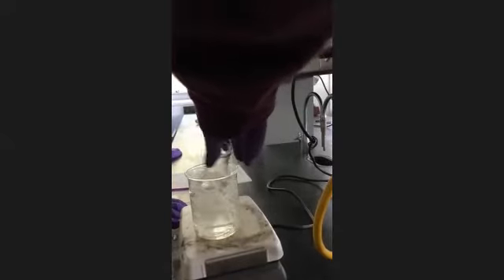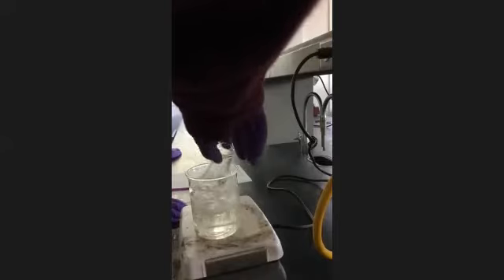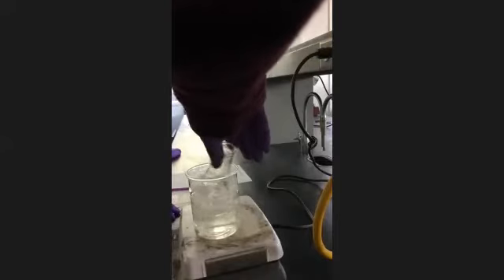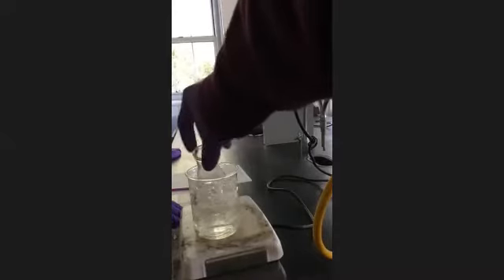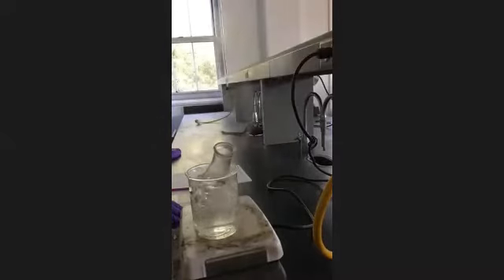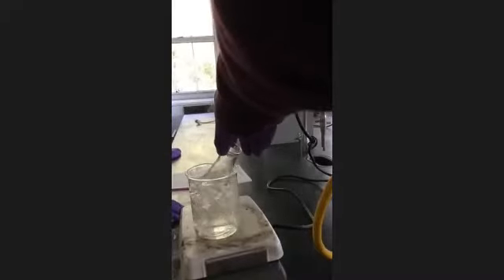All right, he's going. You see it starting to go back liquid. It wasn't hot enough. Now we're cooking with gas. See the difference? If it's not hot enough, it's just going to solidify because some of that acetic anhydride ends up evaporating off. That's a really low boiling point.